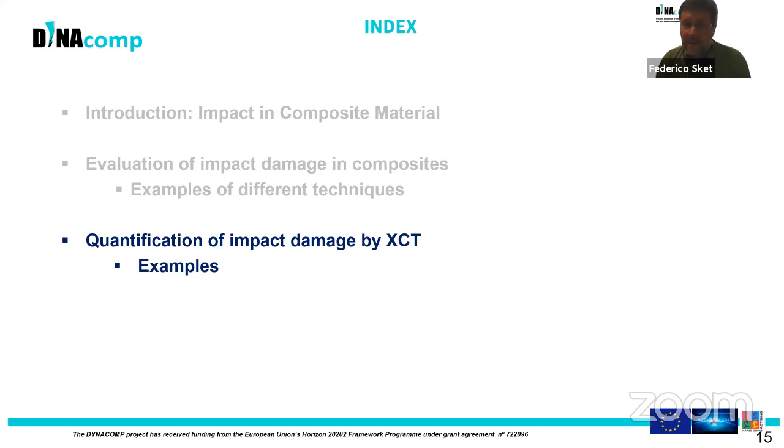So far we have a brief introduction to impact testing of composite materials. We have seen a standard technique which can provide information in 2D or semi-3D of the damage from impact in composite materials. And now let's move on to the evaluation of impact damage in composite materials by X-ray tomography.